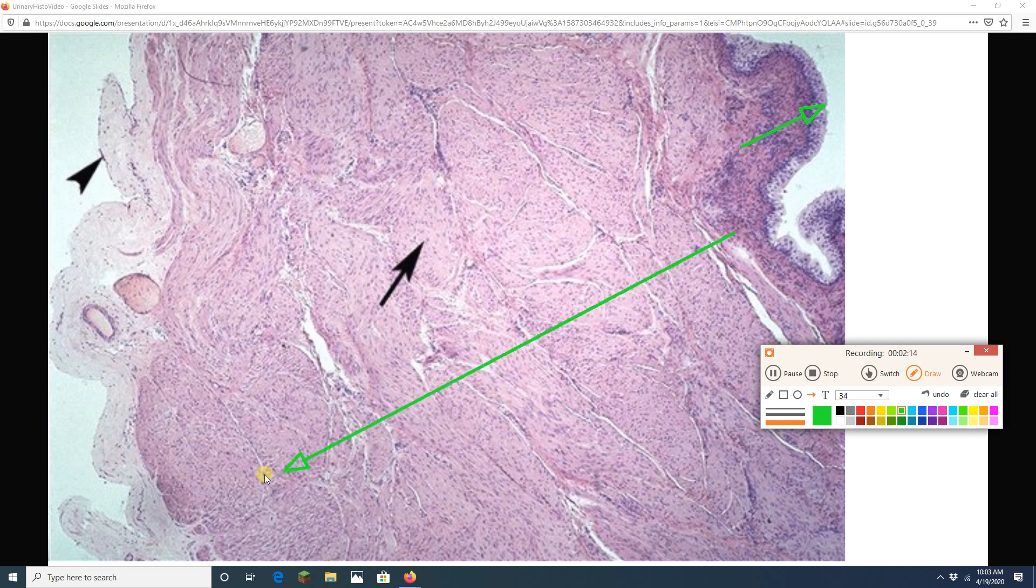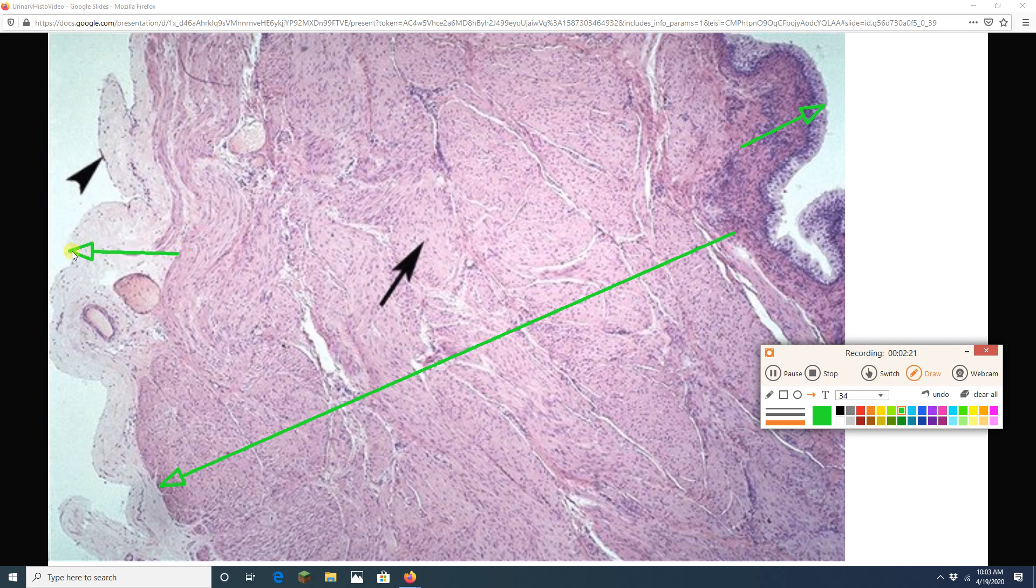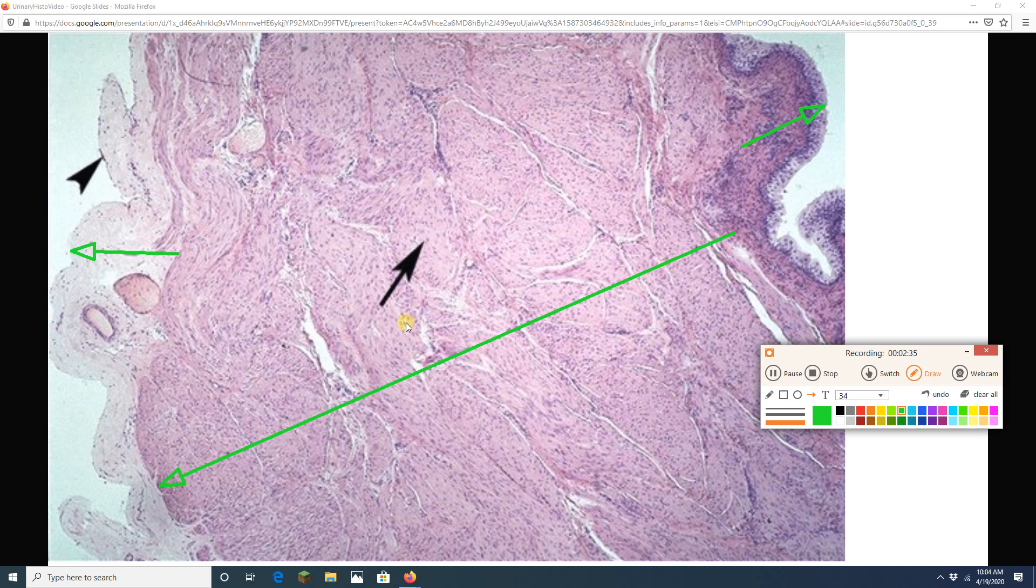Then there is going to be a muscularis externa, so a smooth muscle layer. And then there is going to be an outer adventitia. So that last little green arrow there. So I got my mucosa layer, I got my muscularis externa layer. And remember from the gross anatomy labs that the muscularis externa is also called the detrusor muscle because it detrudes or expels urine.